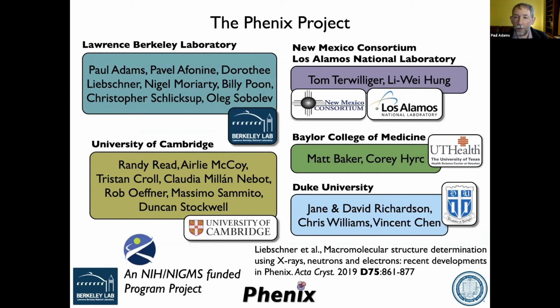So there I started getting a better number without affecting the fit. So in that way, I thought, can we do that manually? As Pavel said, you have the box that allows you to do that, so of course you can do it. In general, we try to make sure that the automatic option is reasonable, right? But yes, if you have some special insight and you find something a bit better, then of course you can do that. That's fine. But you do need to be careful.